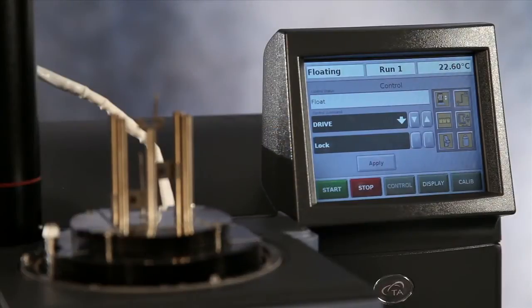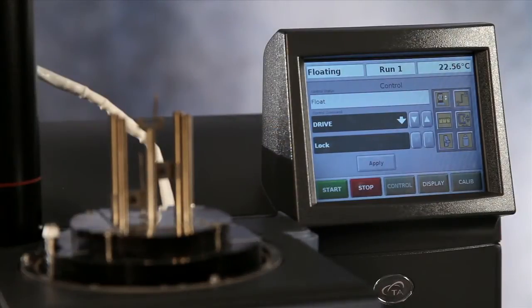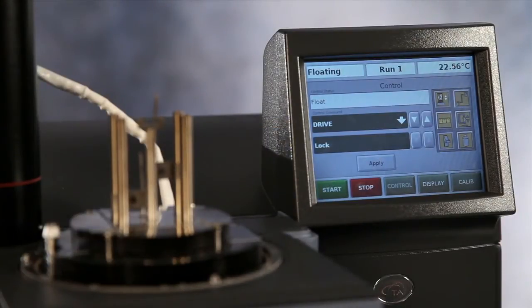This TA Tech Tip is going to show you how to calibrate the Q800 shear sandwich clamp. Before calibration, we shall first install the clamp to the instrument.